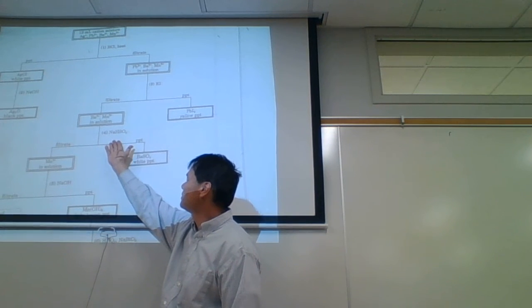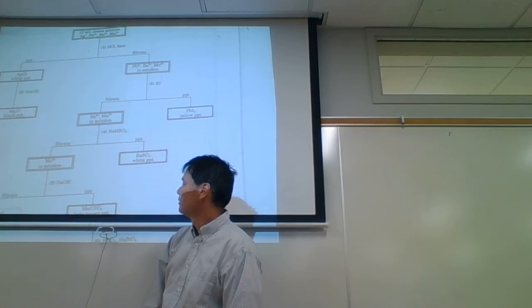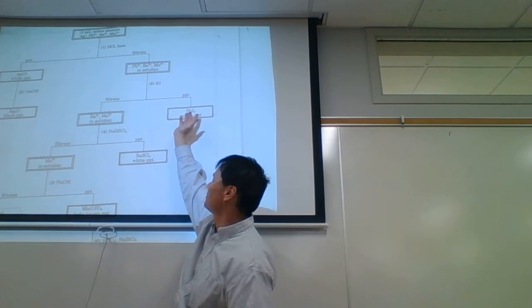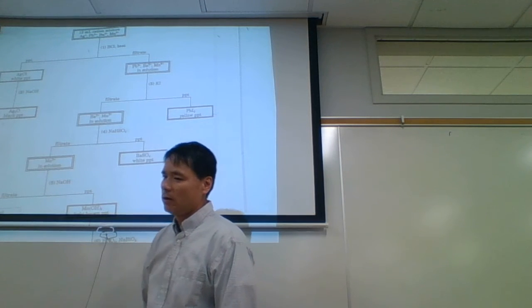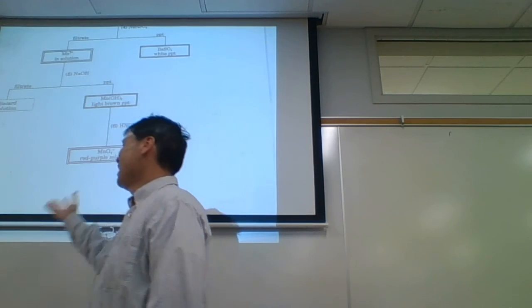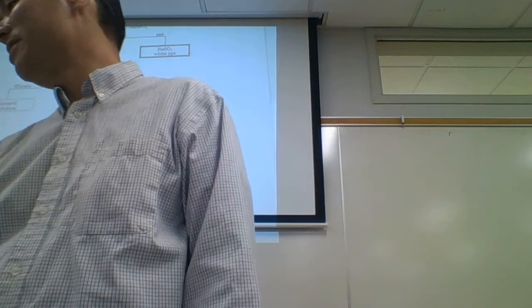The purpose of adding the sodium hydrogen sulfate, or sodium bisulfate, is to get a white PPT. If we get a white PPT here, that's positive for barium ions. If we get a yellow PPT here, that's positive for lead ions. We might not get any of those PPTs. We might end up at this branch. Let's say you didn't have any silver, lead, barium, or manganese. By the time you hit the end, or actually, let's say we have manganese.